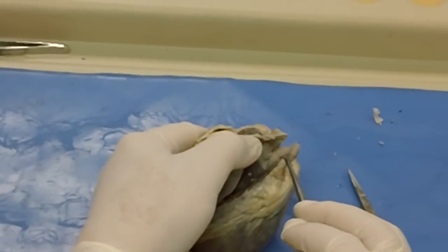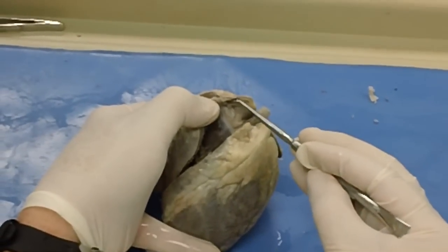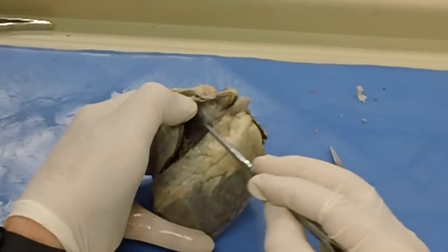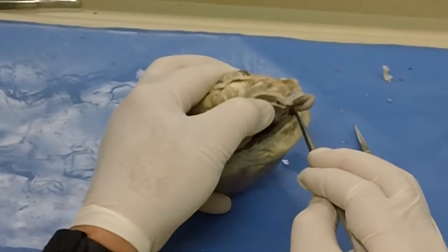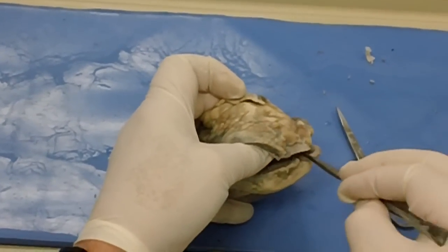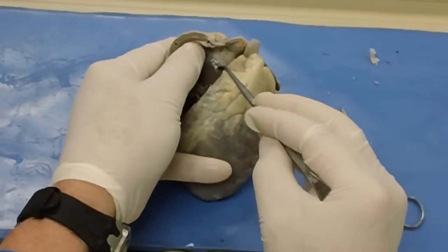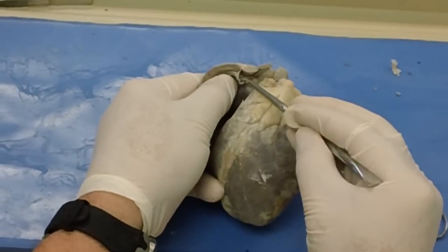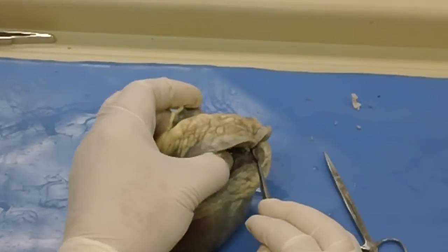There's the pulmonary artery, and look at that. There's a full pulmonic valve cusp right there. The other one is over here in this area that's all squished up. The other one I cut, so there's half of it there and the other half would be right here.